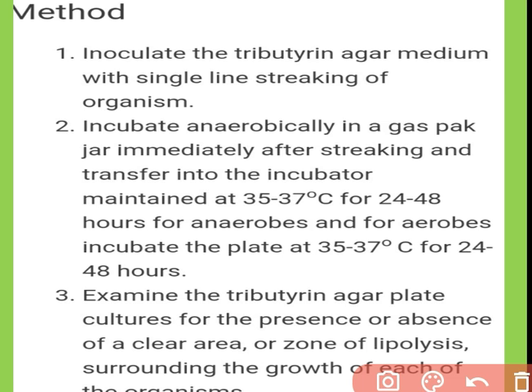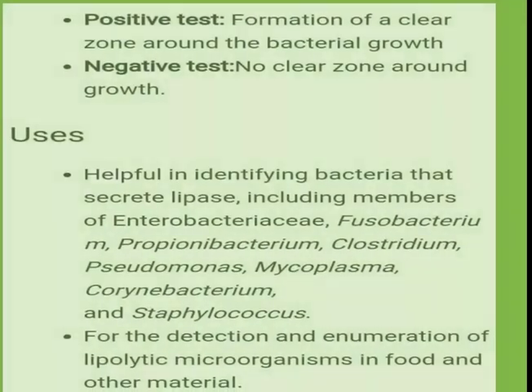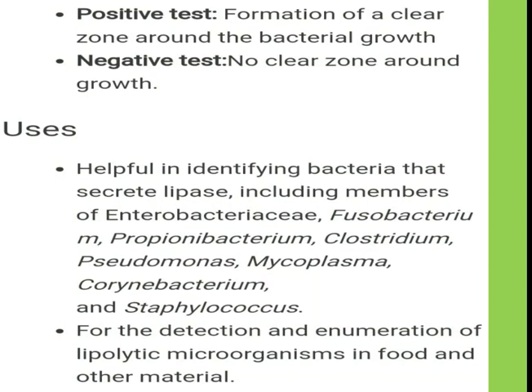After incubation, examine the plates for growth of the organism and, around the growth, for the presence or absence of a clear zone of lipolysis. If the organism has the ability to produce the enzyme lipase, you can see a lipolysis zone around the growth. This lipolysis zone is a clear zone.